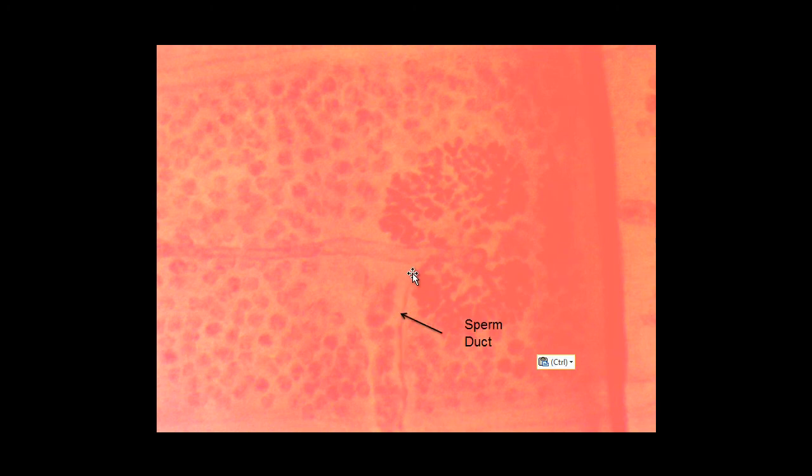These are the testes, which provide sperm to fertilize the ovum. This long structure here is the uterus, where eggs are stored. This is the yolk gland, which provides yolk or nutrients for the developing embryos. This long thin tube is the sperm duct, where sperm is concentrated to fertilize the ovum and manufacture embryos or fertilized eggs.